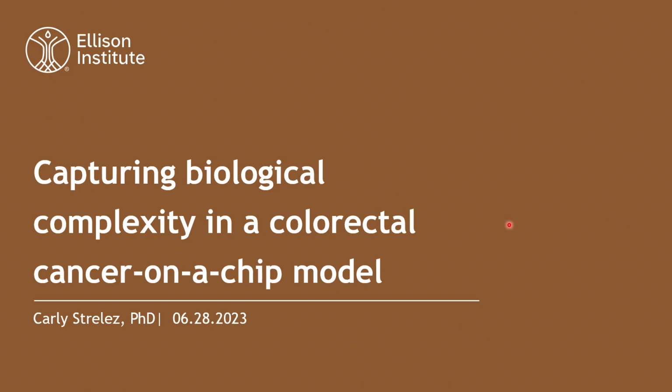My name is Strelez. I am at the Ellison Institute, and I am the organ-on-chip team manager for the Institute. We've been focusing for many years now, since I was a graduate student, on developing a colorectal cancer on a chip model system. I'm going to be talking about two things today: our new patient-derived organoid model system that we spent the last few years working on, and then highlighting an example of how we can use these patient-derived organoids as a case study for a better mechanistic understanding of cancer progression.